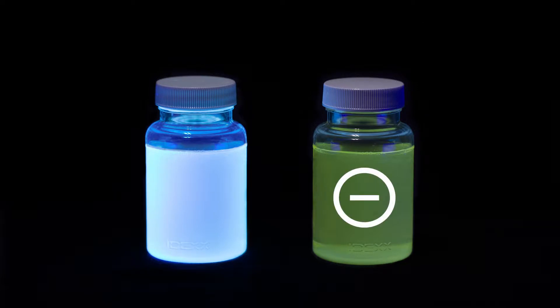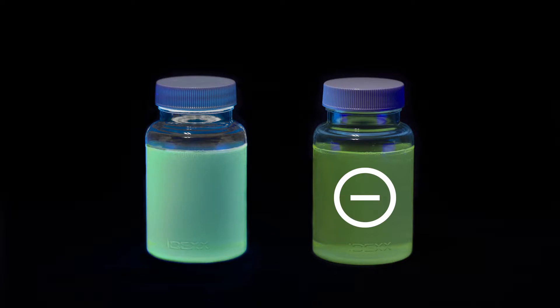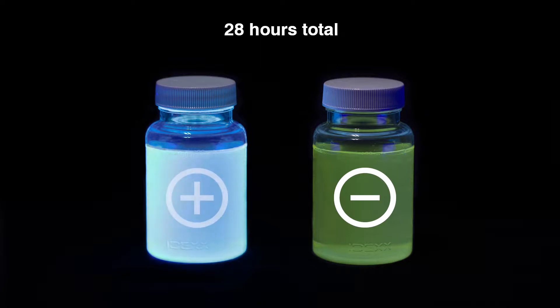In this example, the right sample is negative and the left is positive. If you're unsure whether a result is positive, compare the sample with a known negative. However, if the results are ambiguous based on the initial reading, incubate up to an additional 4 hours, but not to exceed 28 hours total, to allow for the fluorescence to intensify.